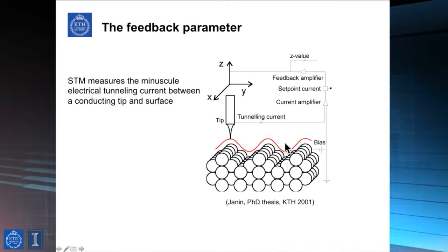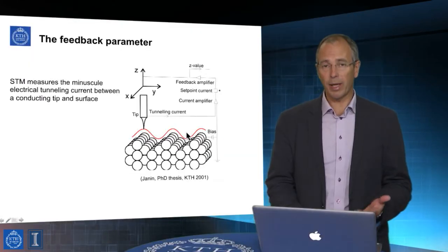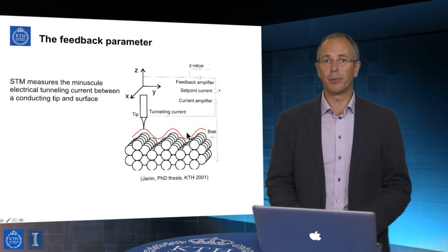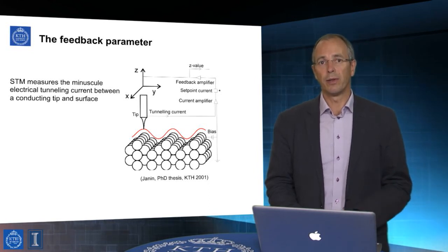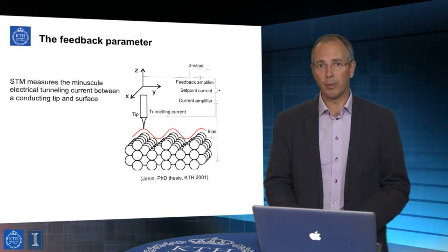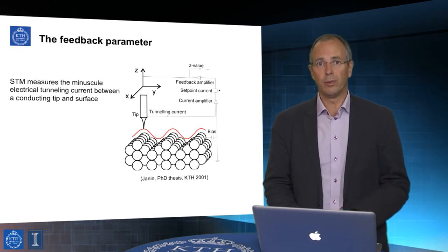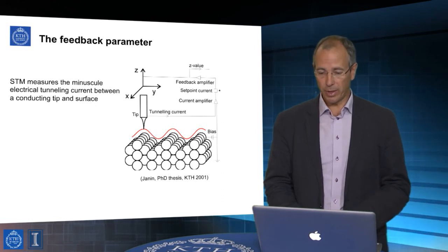The electric current between the tip and the surface is measured, and that provides the feedback to control the height of the substrate with respect to the tip, which provides the information to give you a topographic image of the surface. Essentially, the movement of the piezoelectric scanner up and down gives you the mechanical picture that you need.